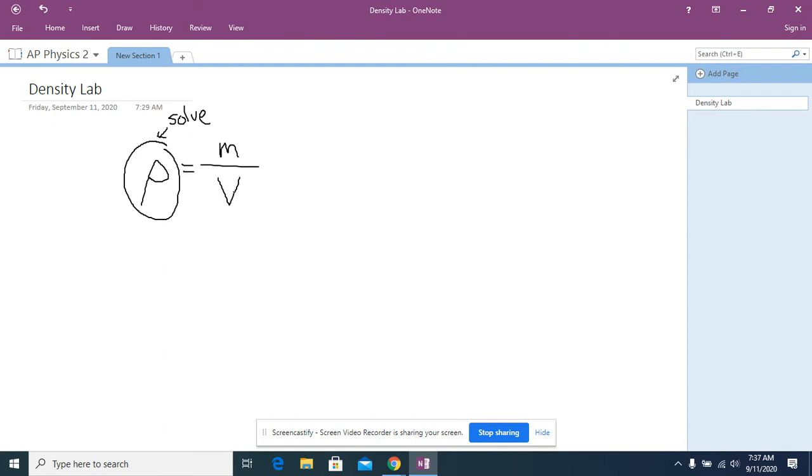Both of those were present on the video. Do that ratio, and then see what it was. But again, what we want to do is to minimize error. We don't want to do it one time. We want to use a graphical approach to do that.